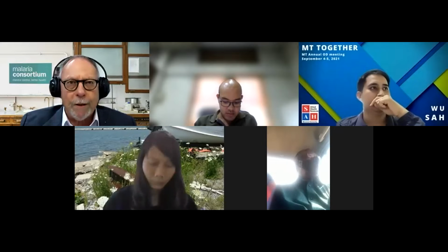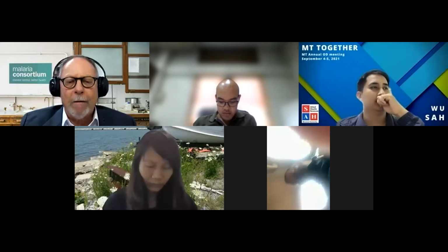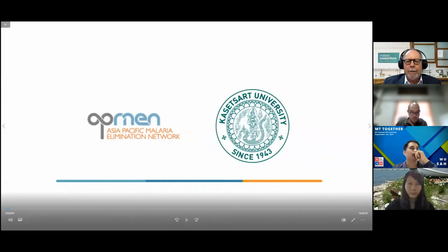So it's also a tool to check for resistance. And basically, a bottle, he will show you in the video, a bottle is coated with a known amount of insecticide, the diagnostic dose. Mosquitoes are then put into the bottle and observed for 2 hours. Resistance is then determined by the percentage of mosquitoes that die, the mortality rate, at the predetermined threshold time during those 2 hours.